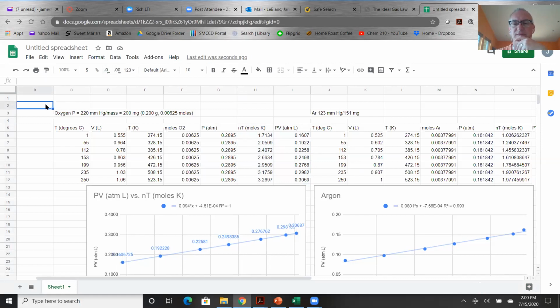Yeah, I would have at least, and I don't think that affects the calculations, right? I think the computer will still keep all those numbers, it just won't show them. I'm not sure if that's correct. When you decrease the decimal place, it just rounds off. Yeah, but it doesn't round off for the calculation, I don't think. I'm not sure. I can't bet on that.